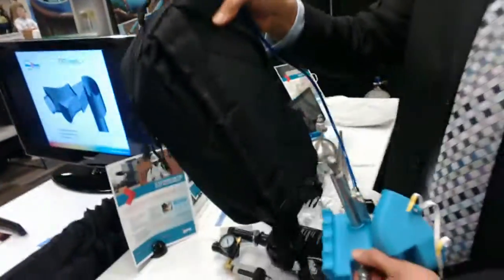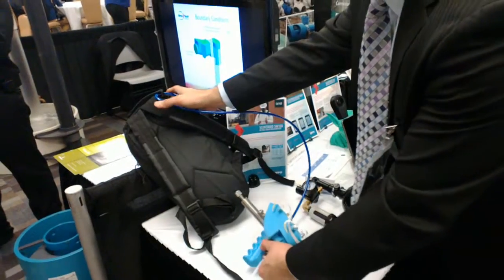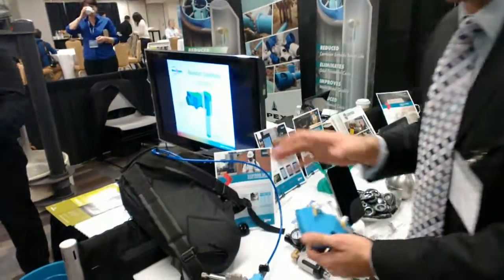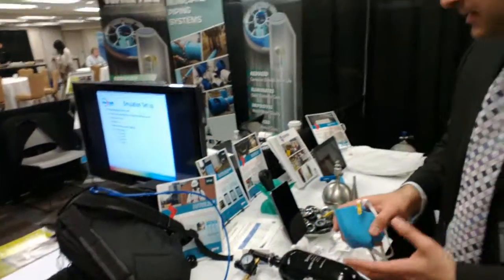It weighs about three kilos. And you can do ambient sampling with it, you can do stack sampling with it, and other analysis. So it will give you odor units for air from a flux chamber or anything like this.